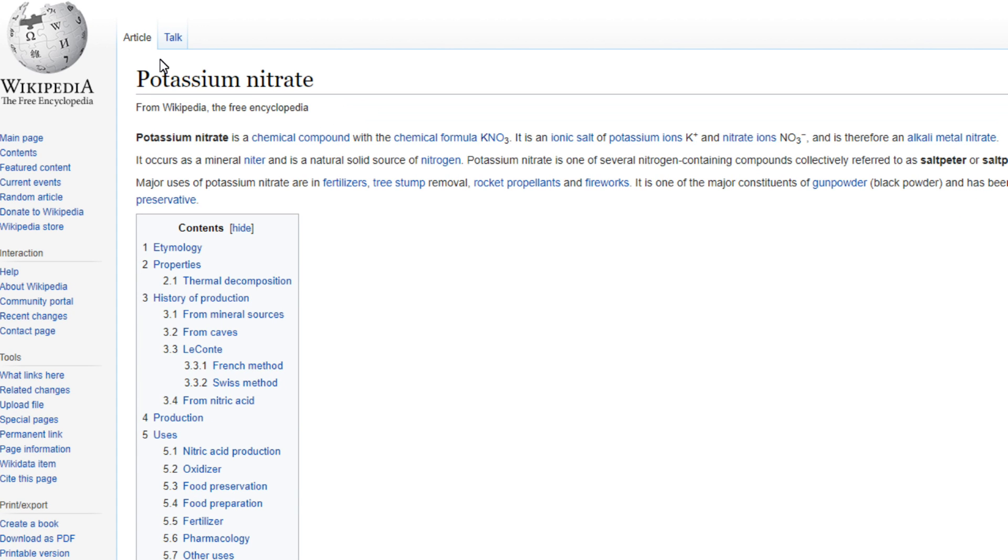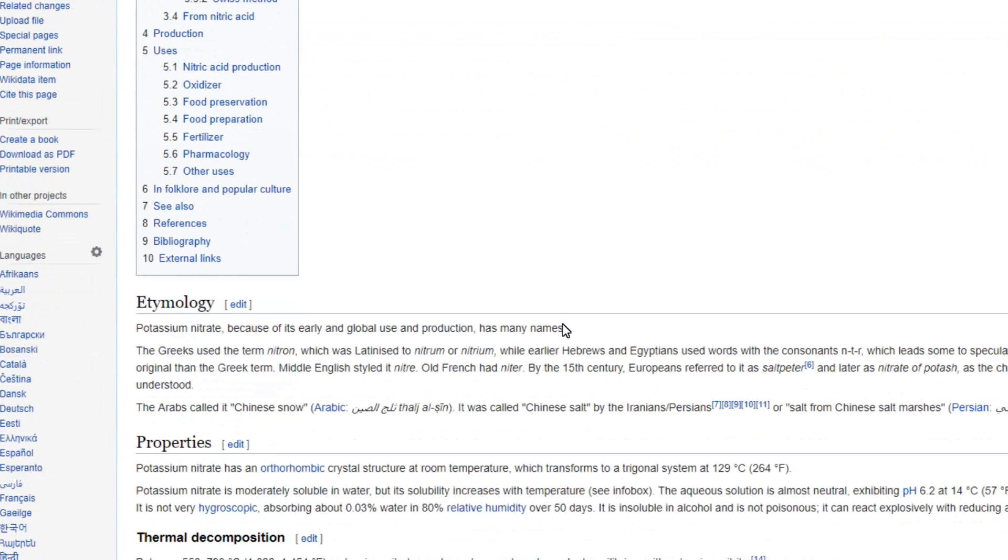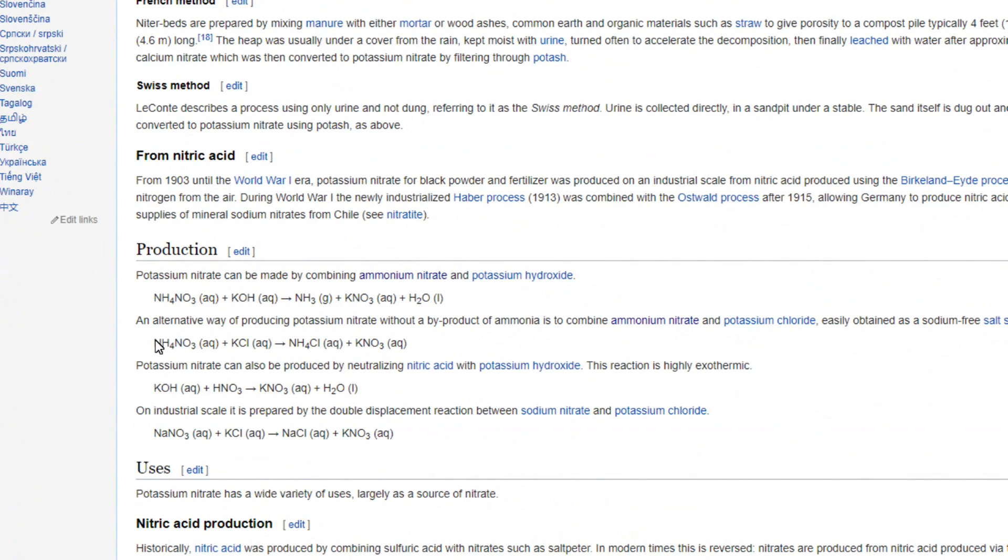Alright, so today I'm going to be making potassium nitrate, which is a really useful chemical in a lot of reactions and it's a fantastic oxidizing agent. To be making this, I'm going to follow this reaction right here using the ammonium nitrate that I made in a previous video and a surplus of potassium chloride that I have.